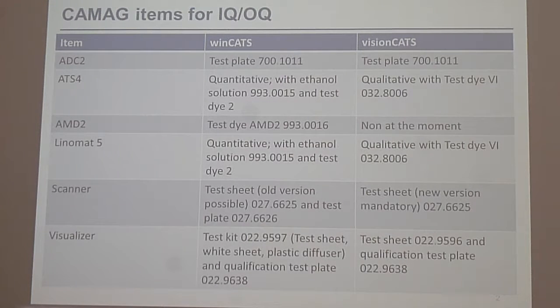The thing is really, that's about qualification. We have the CAMAG qualification here, but every customer can do his own qualification for sure. He has to prove that it is working. If it's working, why not? What I want to say is that they managed to find an ink that is non-volatile, so it can keep long term and be stable for a longer time. The important thing is that it is also working on the 366 and 254.